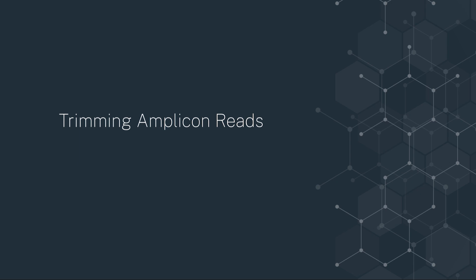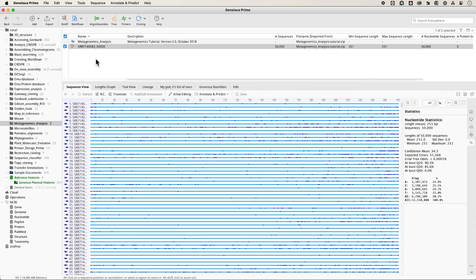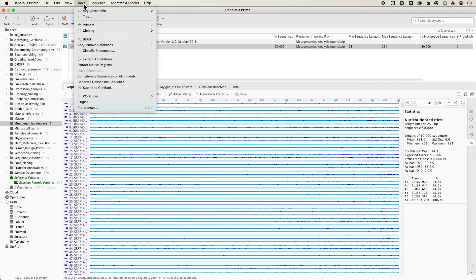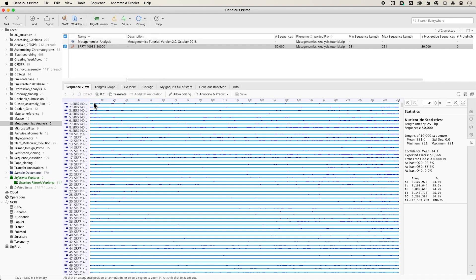Quality trimming of Amplicon metagenomic reads ensures that minor differences in sequences caused by PCR and sequencing errors are not mistaken for valid variation. We recommend using the BBDuk plugin to trim NGS data, as it has more features than the built-in Genius trimmer.